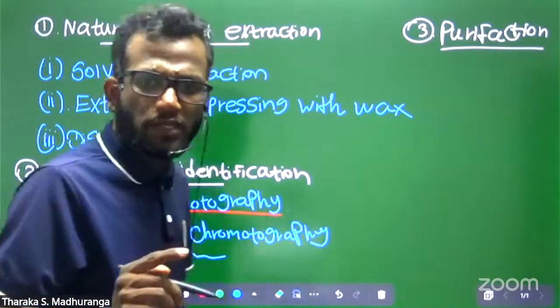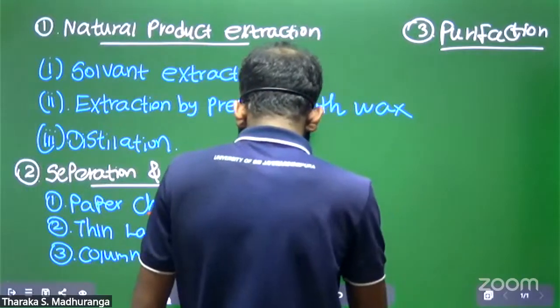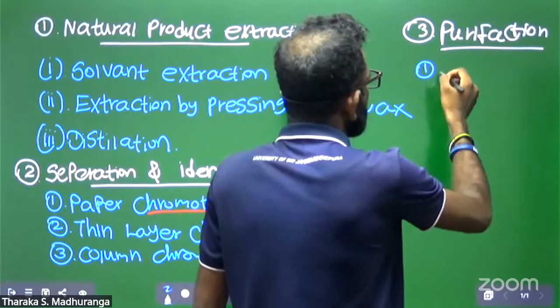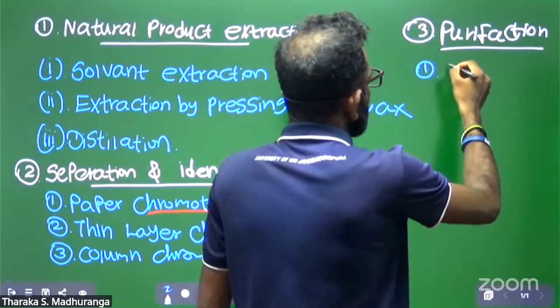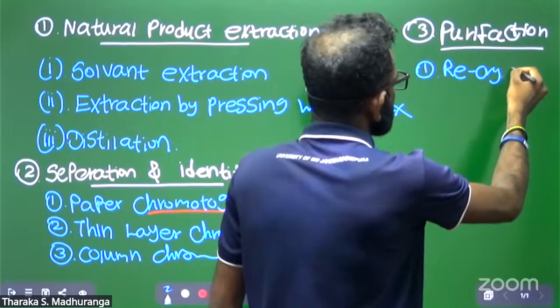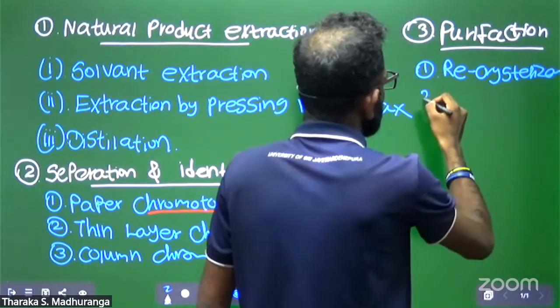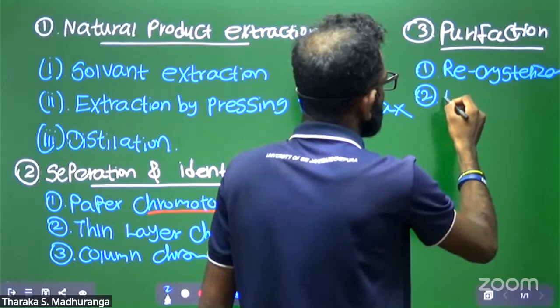What are the purification methods I gave? The first purification method is recrystallization. The second one is distillation.